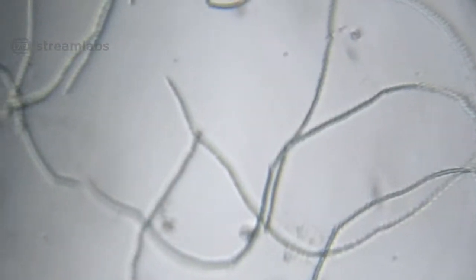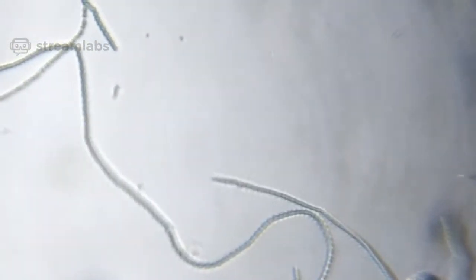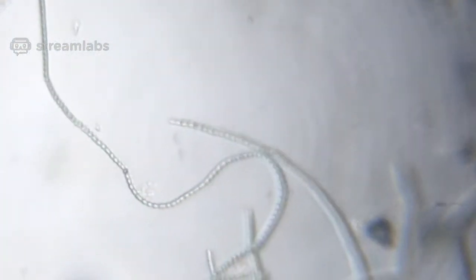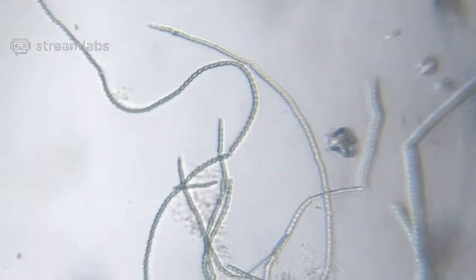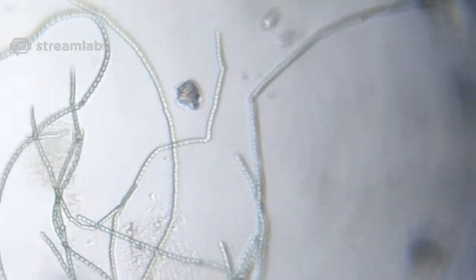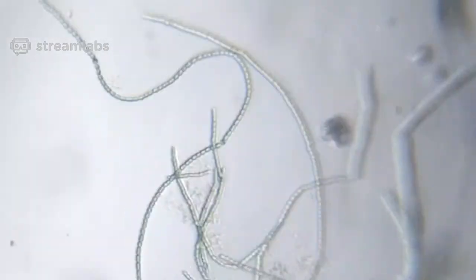Yeah. Right? And if you look very carefully, you might find one cell that is way bigger than the other in the chain. Let's see if you can find any of those. Oh, right here. You do see it? I see some larger ones right there. Okay. So, this is a very important organism called Nostoc.